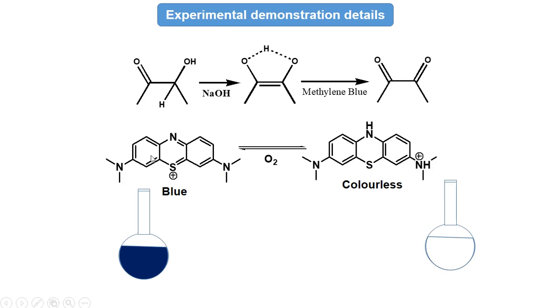Okay, and this one is the experimental demonstration details, like the mechanisms behind all this.